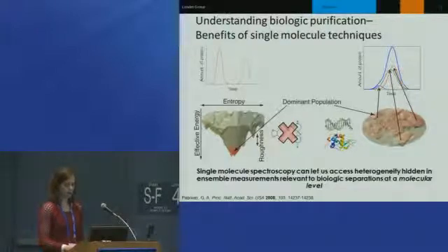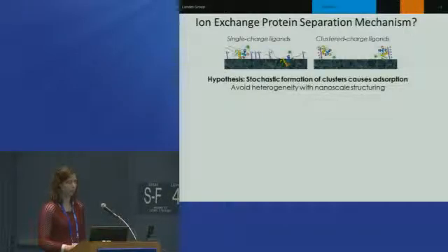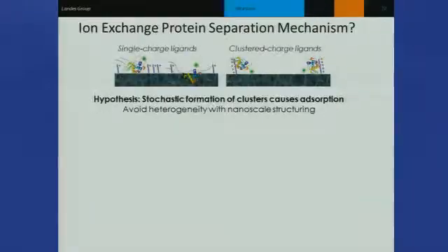And of course, as spectroscopists, we'd like to use our tool set, or even develop a new tool set, that would be appropriate for understanding that. Based on that Wu and Walters paper and also some preliminary work in the Wilson group at UH, we're going to hypothesize that one of the methods for preparing ion exchange ligand packing is going to lead to a hidden phenomenon.